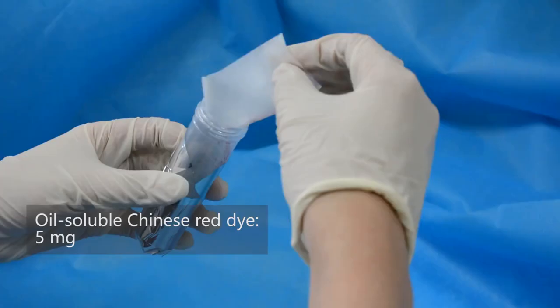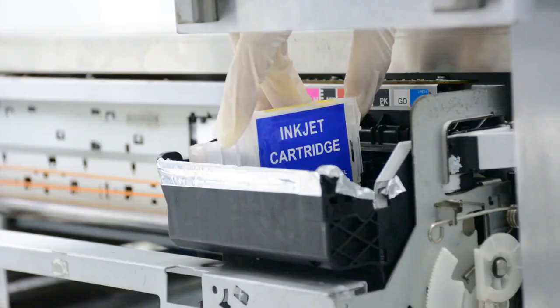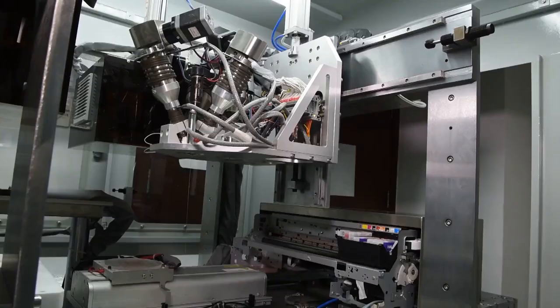Material preparation for polyjet printing. Add material, sonicate. Add Chinese red dye. Load them into the cartridges.